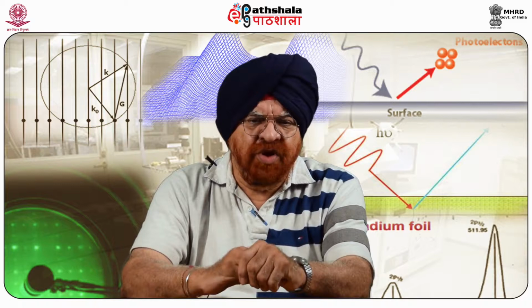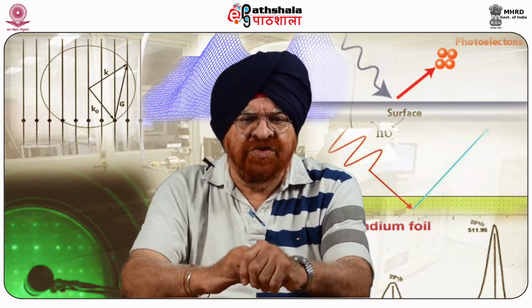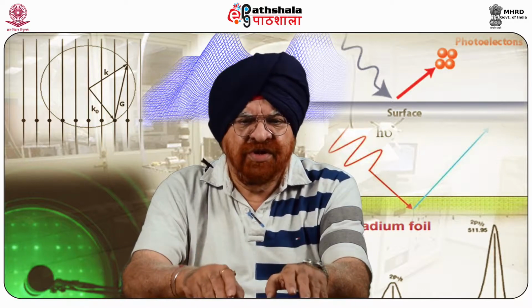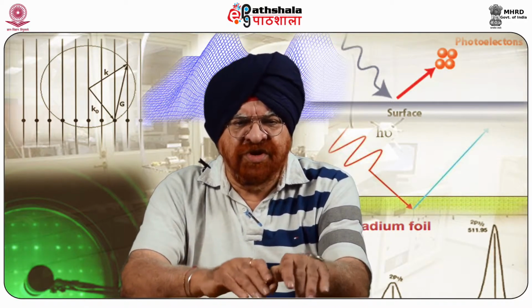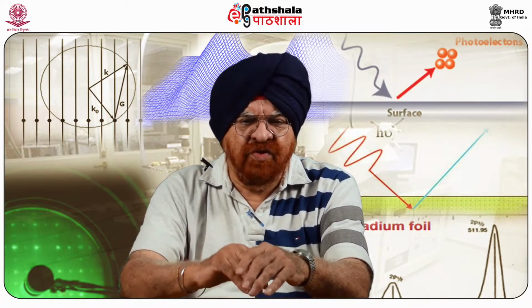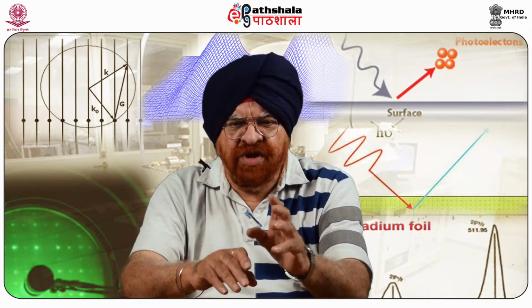The frequency modulated Kelvin probe force microscopy has significant advantages in terms of both sensitivity and resolution when applied to metal and inorganic interfaces in vacuum.